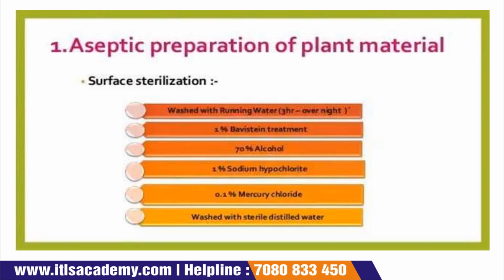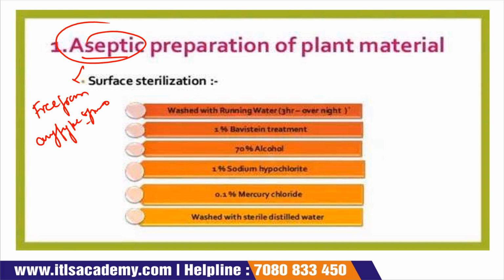Now the next is the aseptic preparation of plant material. Aseptic preparation means an environment free from any type of microorganism. Okay, so first of all, we take a plant and we wash it with running water for 3 hours or overnight.